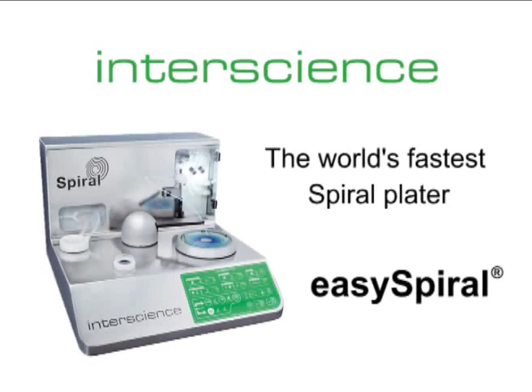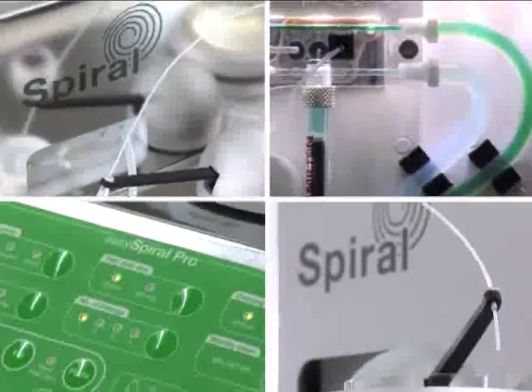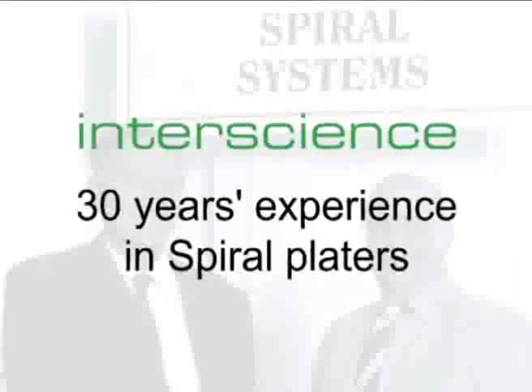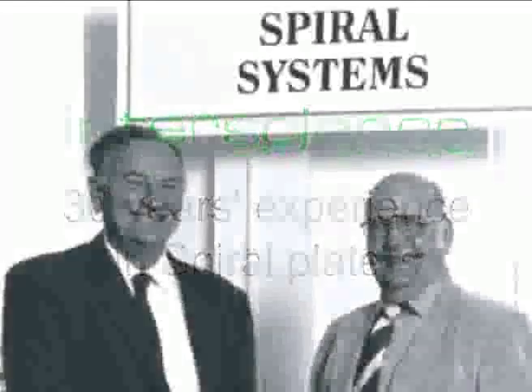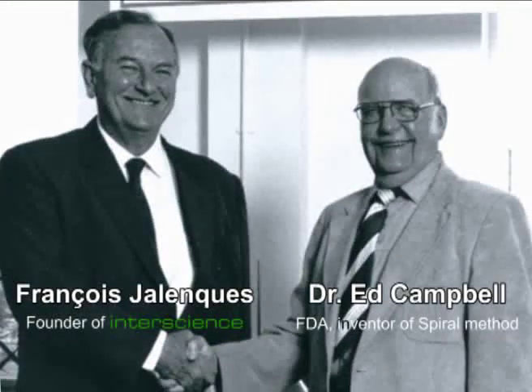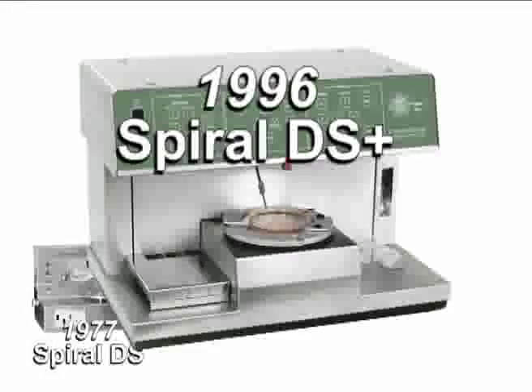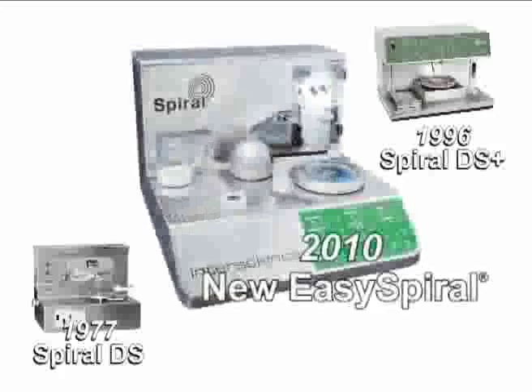InterScience is proud to introduce the easySpiral Automatic Plater. Based on 30 years of research and manufacturing experience, the easySpiral, third generation of InterScience Spiral Platers, is the fastest and most advanced spiral plater on the market.